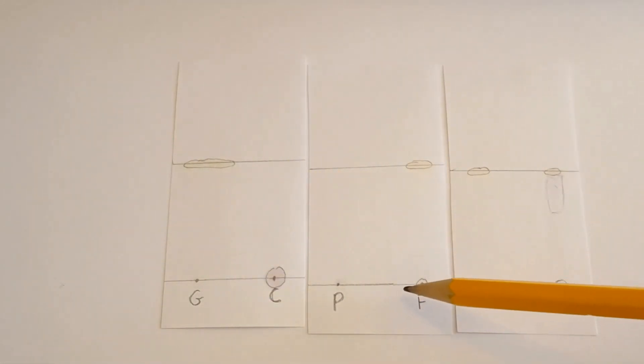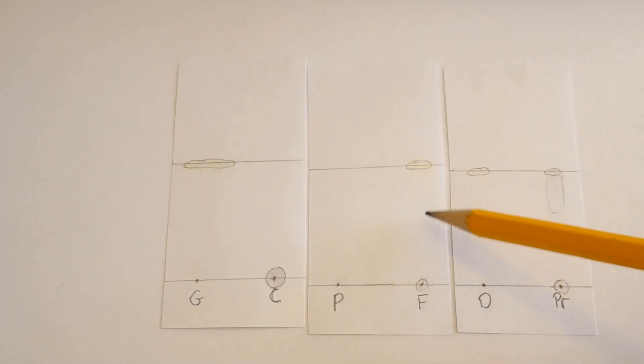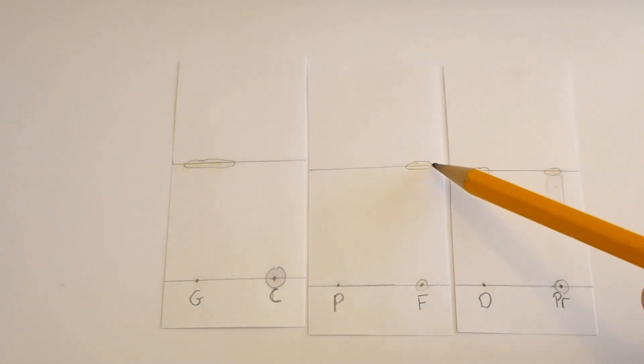Now we couldn't see anything in the pulmonaria or lungwort. But in the forsythia there were two things. There was this one here, now this didn't move at all. It was like the one stuck and they couldn't get very far. But then there's this yellow colour. The daffodil had that as well. And that moved really far. It stayed with the solvent. So it didn't interact much with the paper, did it? And possibly these two compounds, these two molecules are quite similar because they both travelled really quickly with the solvent.